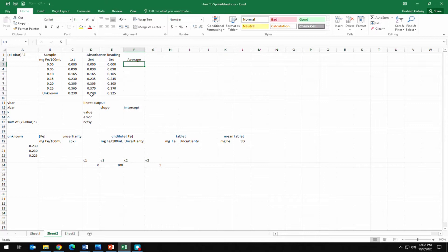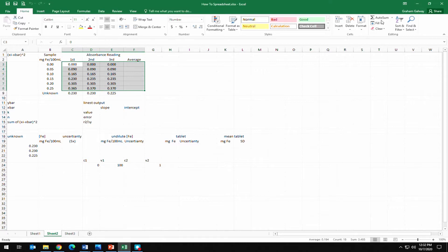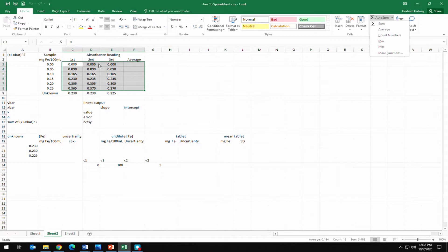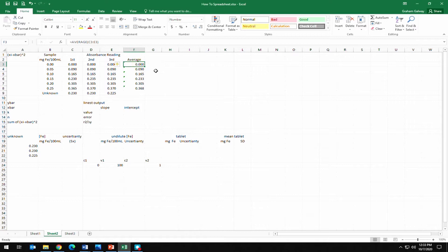We'll need to average the standard values to analyze and generate a calibration curve. Using the AVERAGE function and selecting all the cells in each row, we can see each one calculates the associated average of that row, giving us our various averaged values. You can see the formula up in the formula bar.